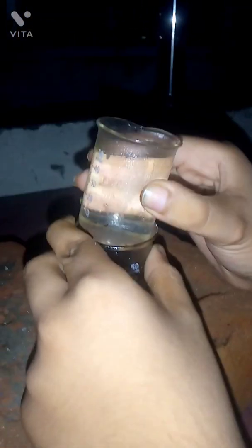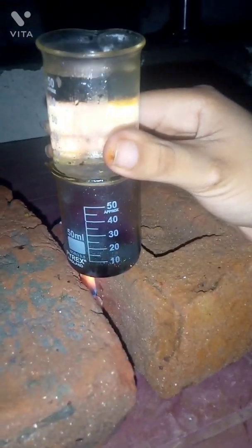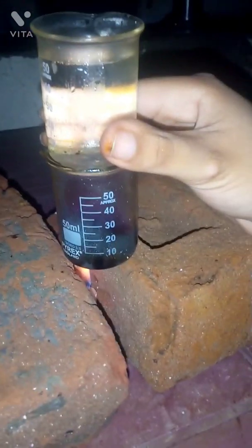First I remove the top glass, to make sure the iodine is still present. Yes, a purple film is coming and settling at the top. It will look like a shiny silver mirror, a shiny bluish mirror.